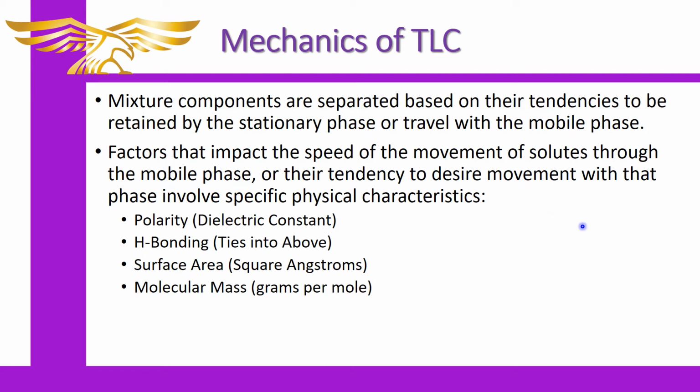So the factors most important, which have not been discussed, are those solvent parameters and the parameters the molecule has for which you would choose a solvent. Some of the most important are the polarity, which can include hydrogen bonding in this case because that's a special kind of interaction that relates to dipoles and to electrostatic effects. But also surface area is important because you'll remember from general chemistry that a lot of molecules, if they don't have polarity, have a degree of London dispersion forces or van der Waals forces, as they are more favorably called for myself.